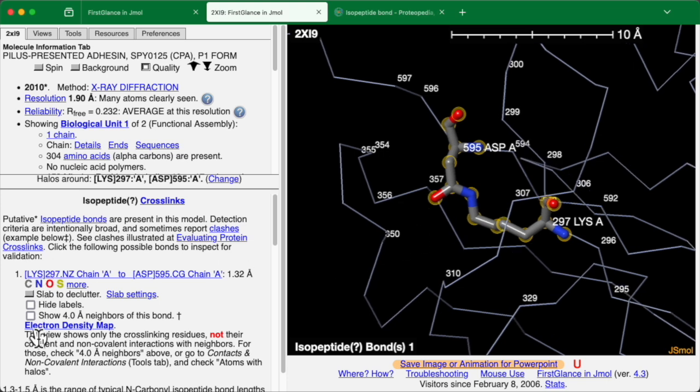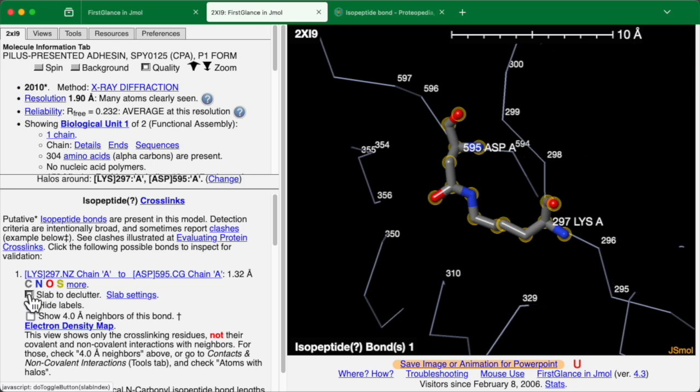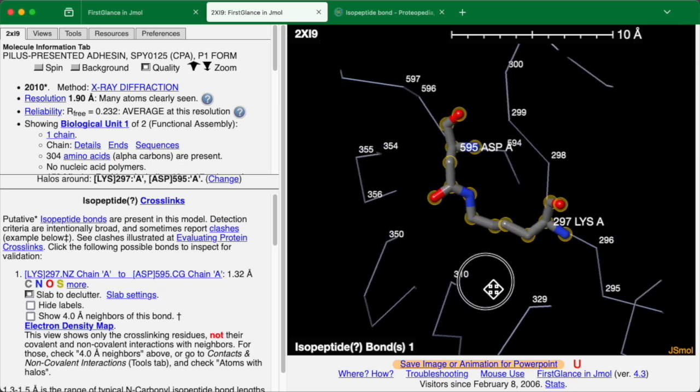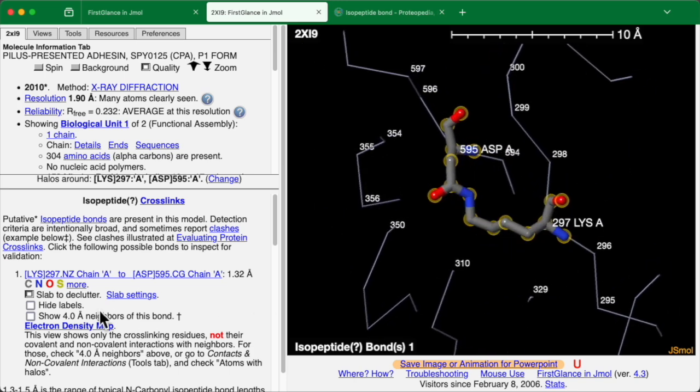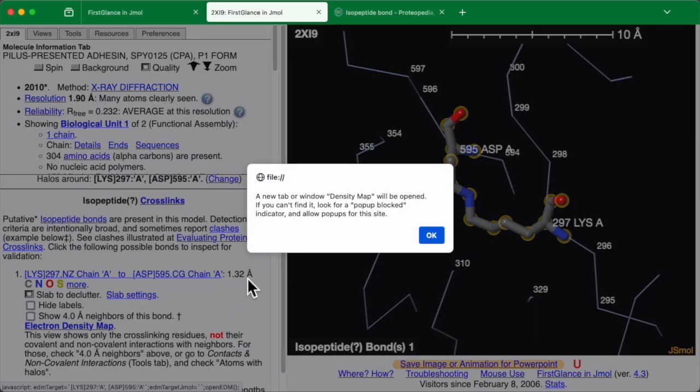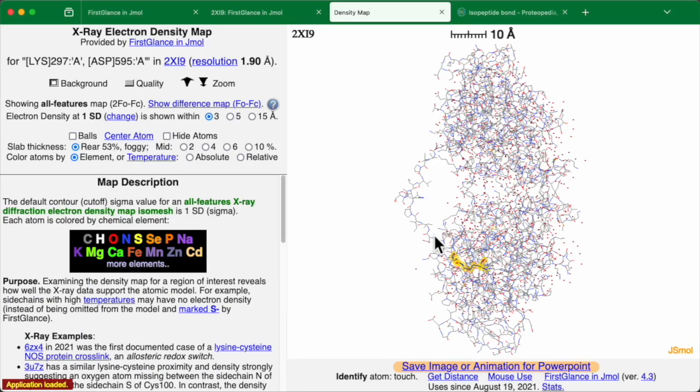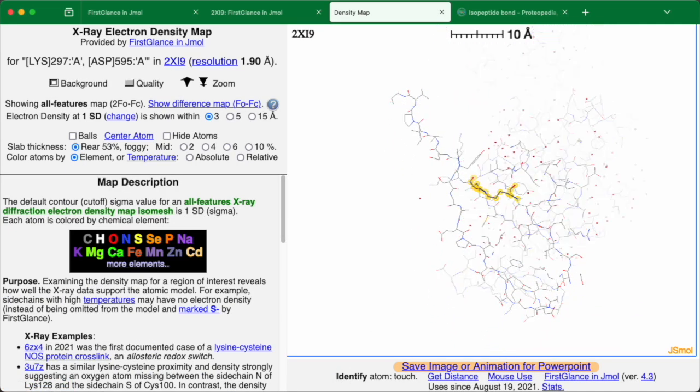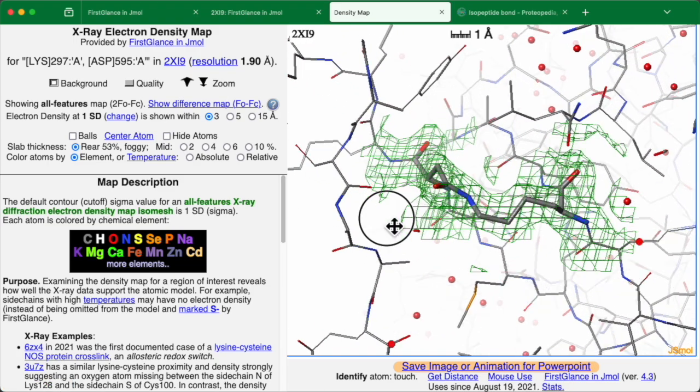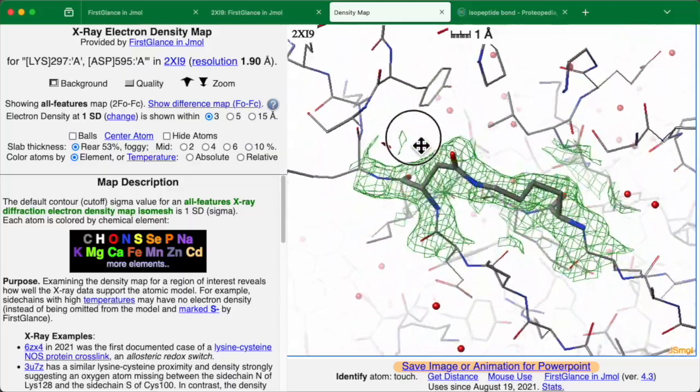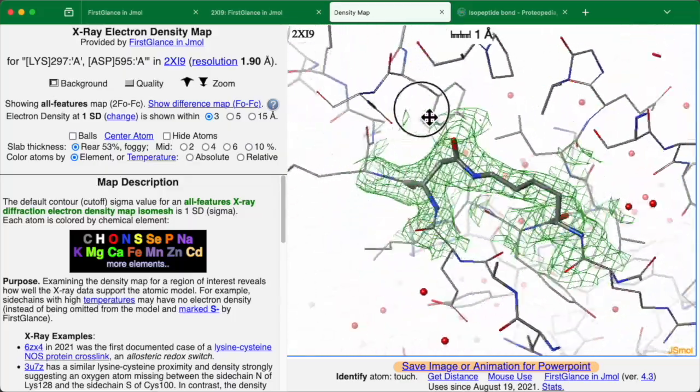Well, over here we have a number of convenience tools, one of which, by the way, is to turn on slab, which hides things that are in front of and behind this bond, making it a little easier to see. But the most important one for validation is to look at the electron density map. You simply click on that link and it alerts you that this will appear in a new tab or browser window. You see the isopeptide bond. It zooms in on it and then shows you the electron density isomesh or map around the atoms of interest.